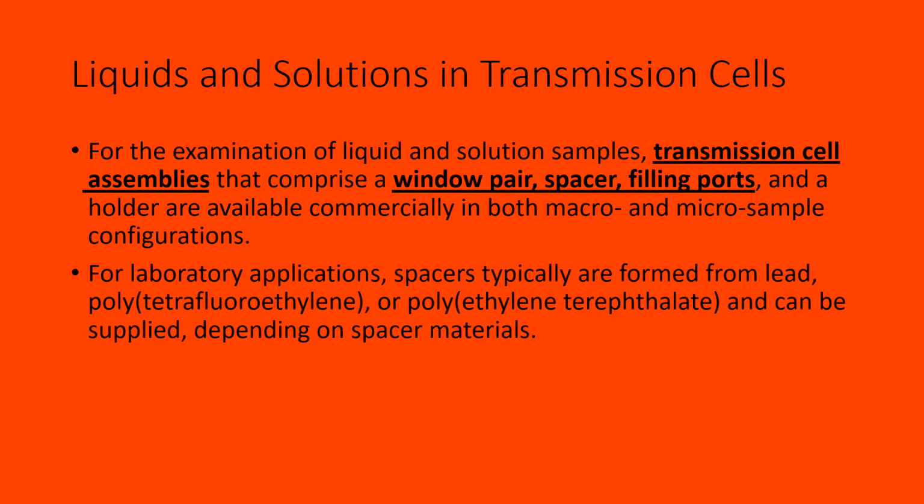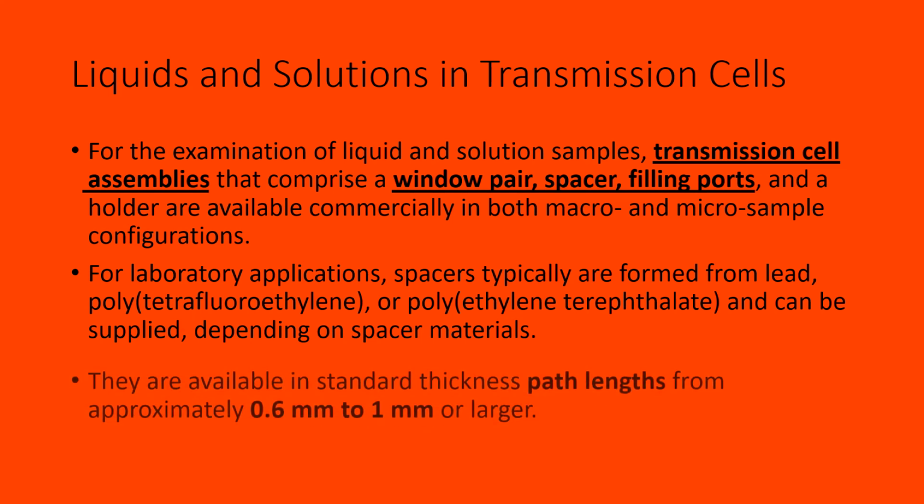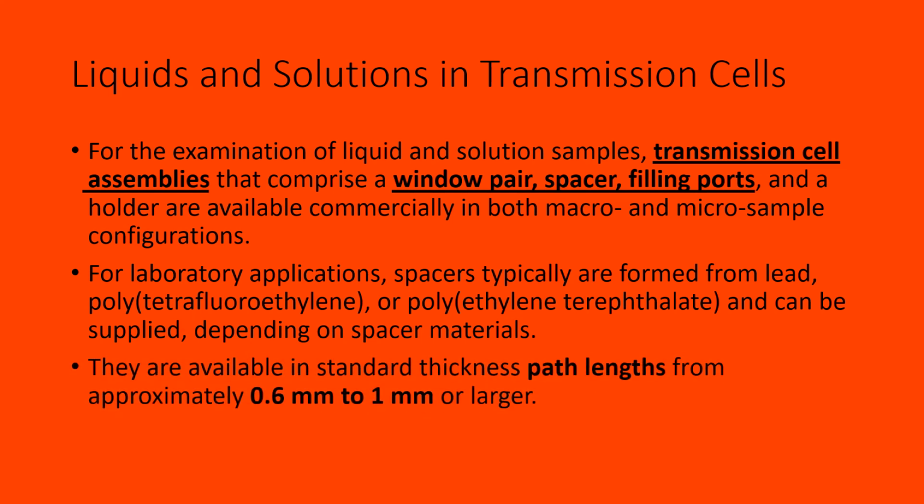For laboratory applications, spacers typically are formed from PTFE, that means polytetrafluoroethylene, or polyethylene terephthalate, and can be supplied depending on the spacer materials. They are available in standard thickness of path lengths from approximately 0.6 mm to 1 mm or even larger.